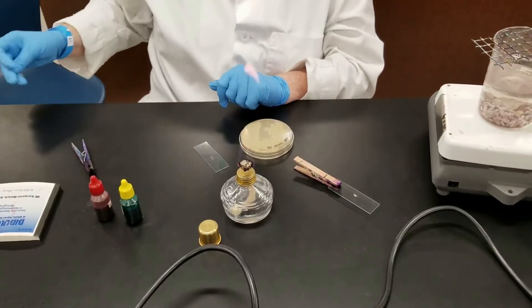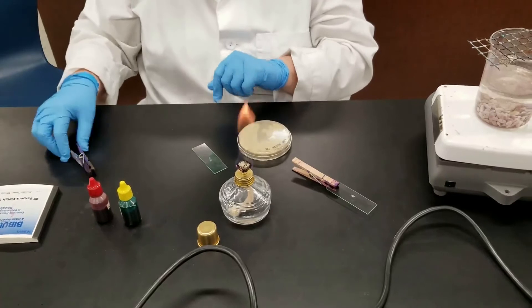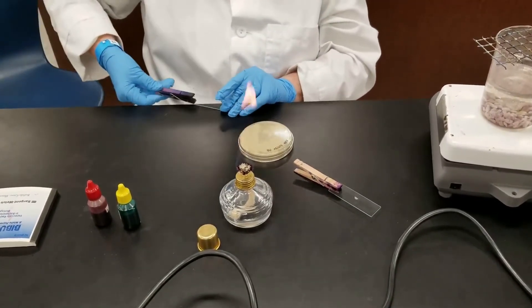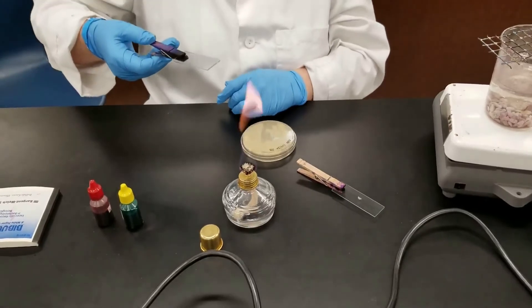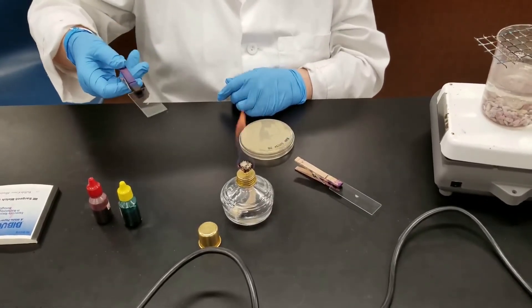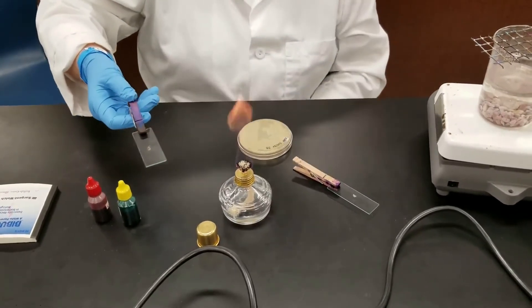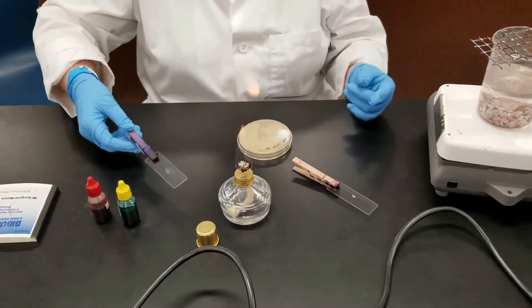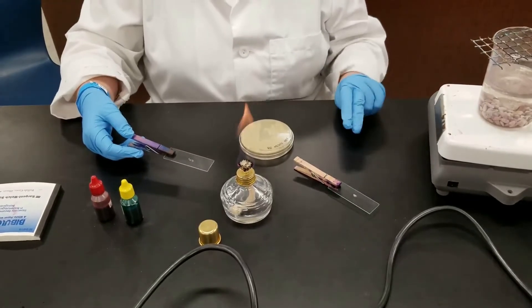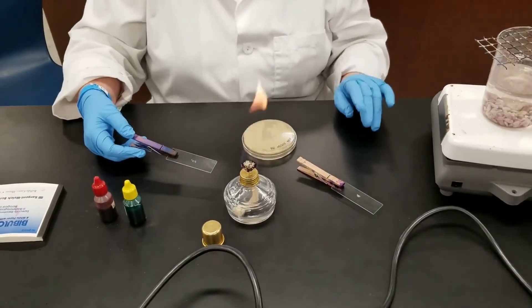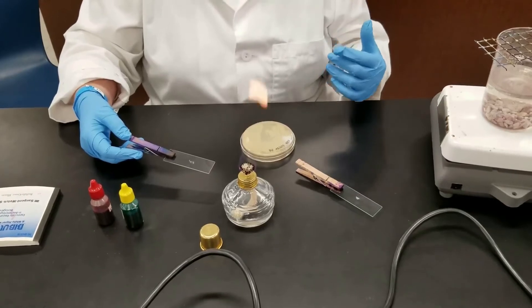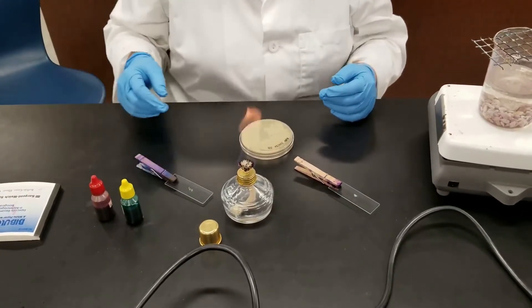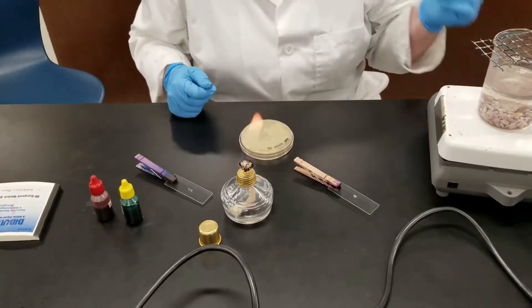I am done with the loop now, so I can handle the slide. I'm putting this clothespin on it. Now I'm going to heat fix it. That's where we just pass it through the flame a few times. That is going to kill the organism number one, it adheres it to the slide number two, and number three it's going to help the penetration of the stain.